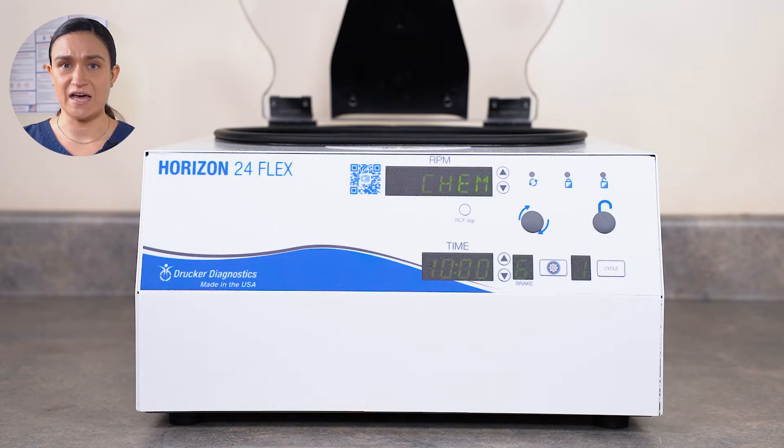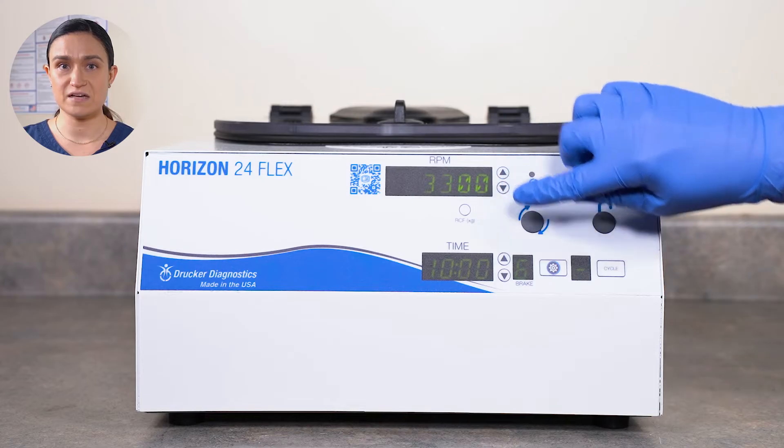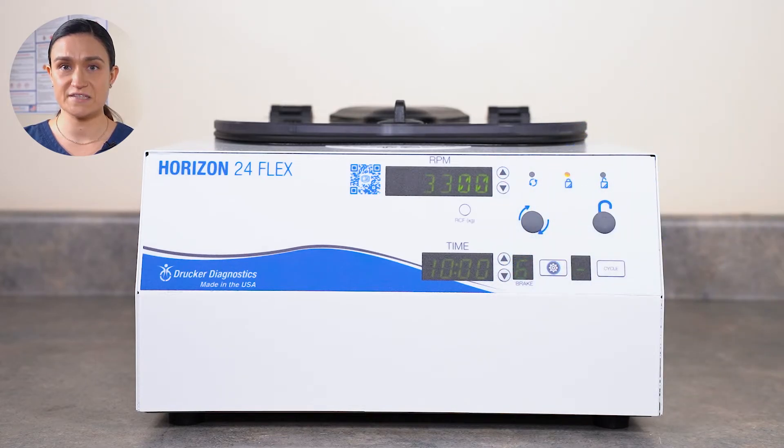RPM, time, and other settings can be adjusted on the fly. New saved settings can be logged into the Horizon 24 Flex's memory, and single cycle lock or presets-only mode can be engaged.